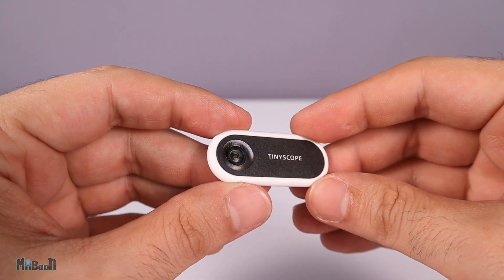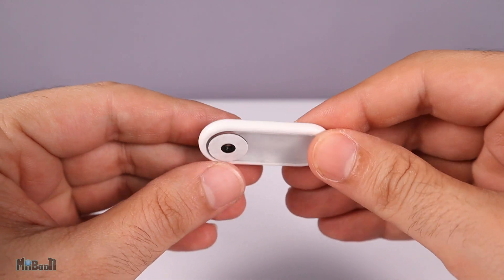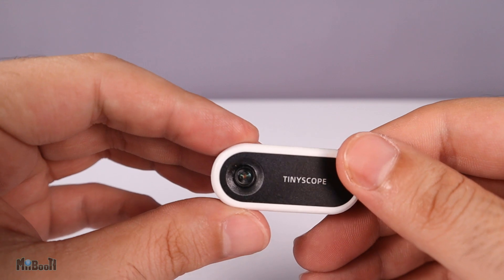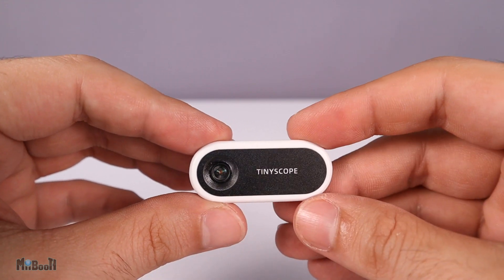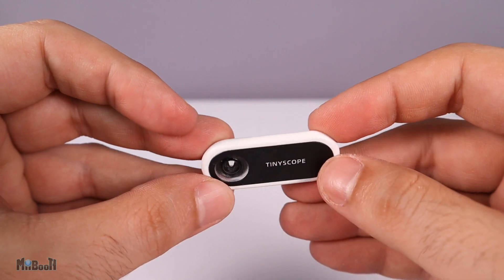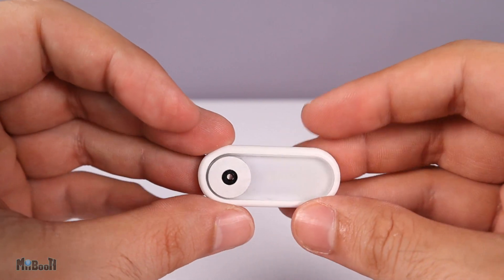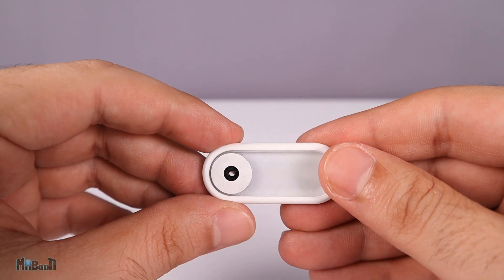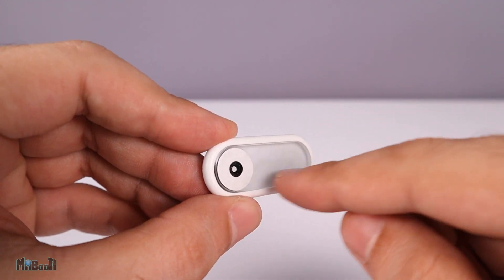Essentially the microscope is nothing more than a super macro lens encased in plastic. Build quality looks good — steady, good finishing around the edges, no loose parts, overall decent quality. On the back of the lens, one of those donut-shaped stickers is already attached.